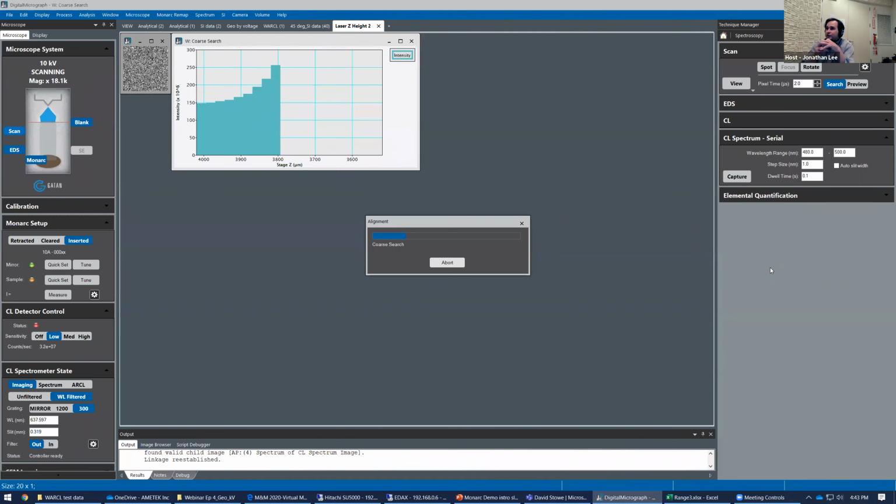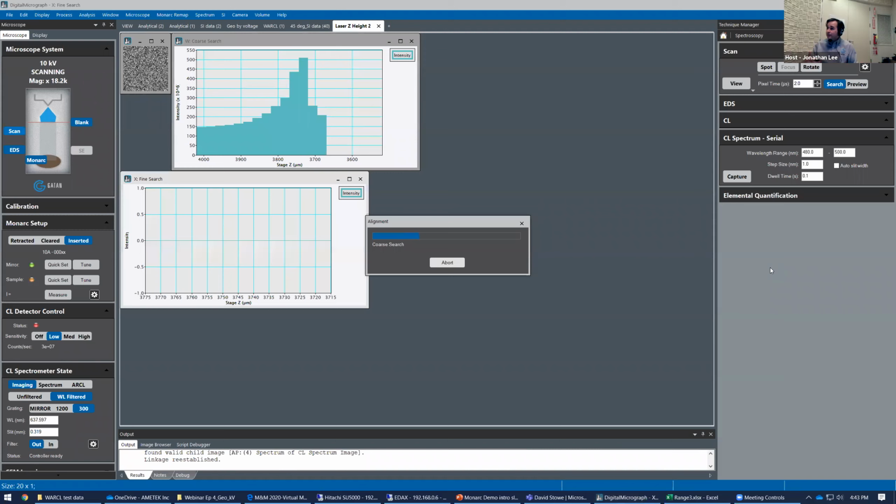So this is a procedure that would really help with scattered nanoparticles on a silicon substrate, for instance, where there's not a lot of light coming from the sample under the electron beam. You just have scattered emitters. So in this case, it doesn't matter if there's any emission at all, essentially. It'll find any reflective surface that has, I think it's around 1% reflectivity at around 630 nanometers. So there's a lot of opportunity for it to succeed.